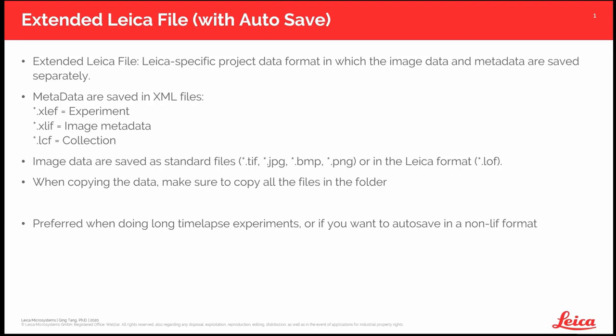When do you use it? Usually it is preferred when you do long time-lapse experiments, or if you just want to autosave in a non-LIF format like TIFF.